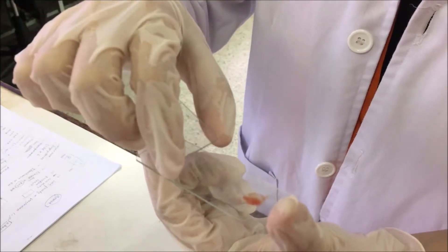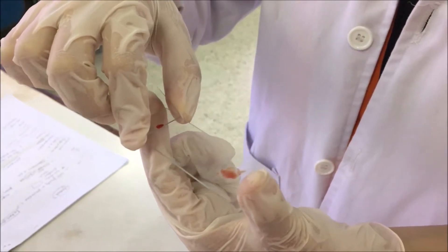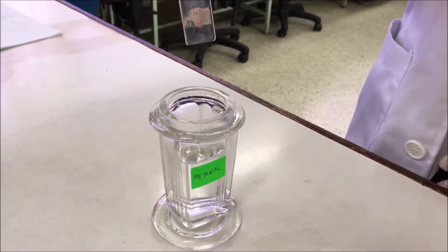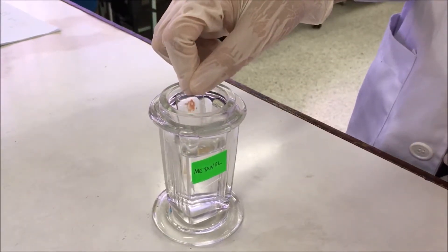Perform blood smear. Fix the thin films with methanol for a few seconds.